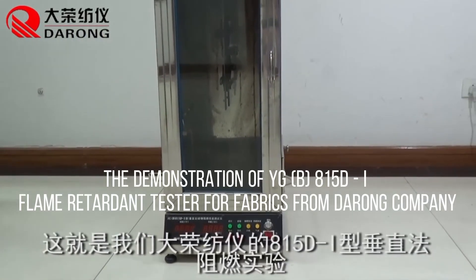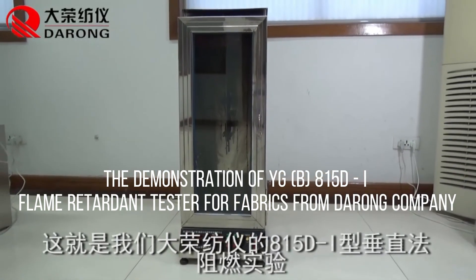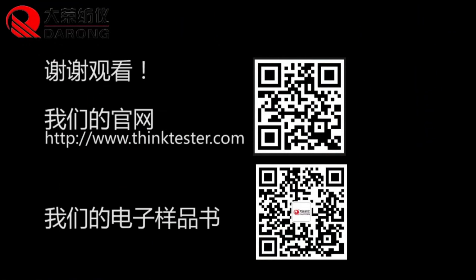The demonstration of YG(B)815D-I flame retardant tester for fabrics from Darong Company.